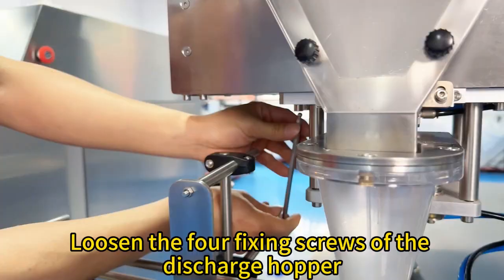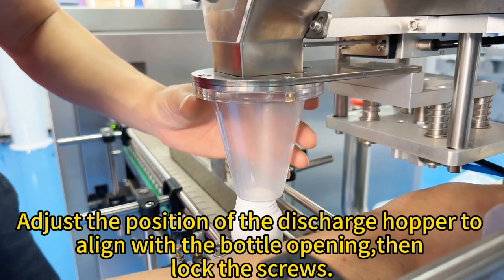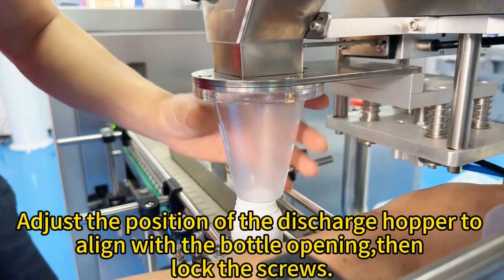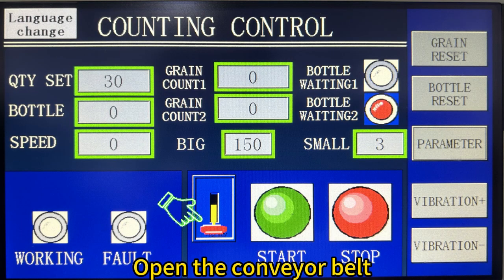After completing the adjustment, release the cylinder. Adjust the bottle mouth position to align with the discharge hopper. Loosen the four fixing screws of the discharge hopper, adjust the position of the discharge hopper to align with the bottle opening, then lock the screws and open the conveyor belt.